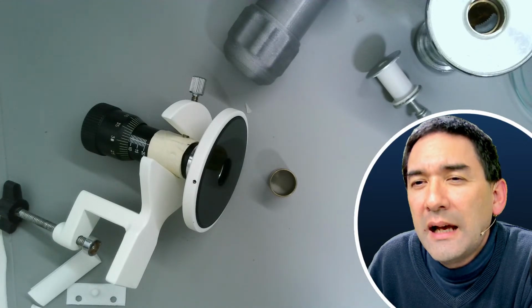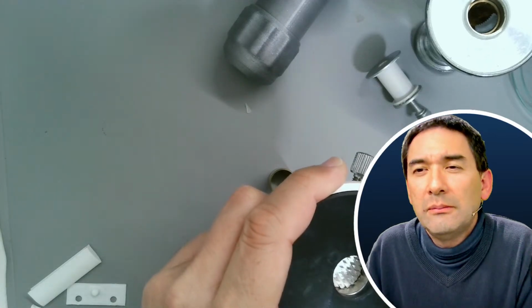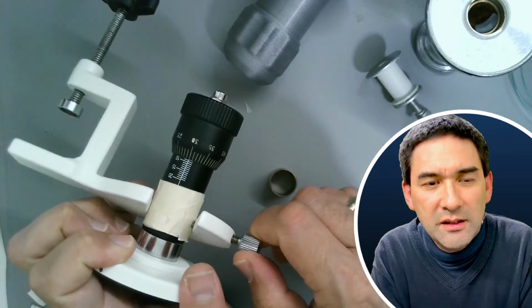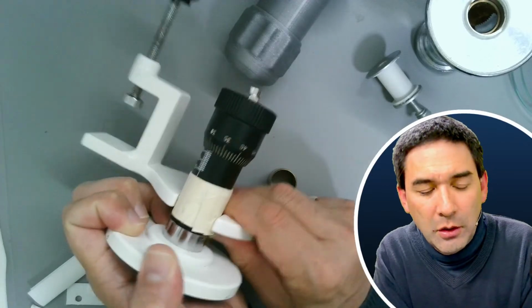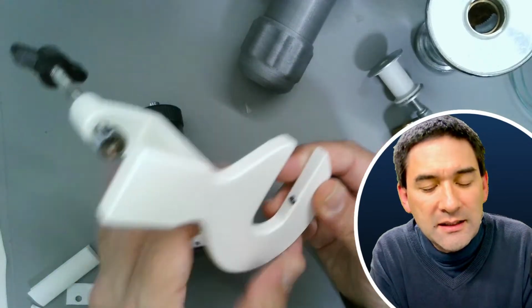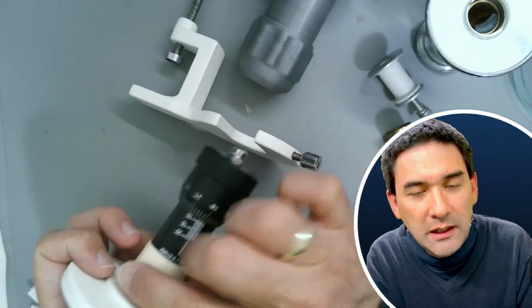Is it the hole on the side of the big white microtome? I don't understand now. The thing is, it's kind of held like this here, and this is the screw that holds the clamp of this one here. It's a little bit hard to move out because I added this paper tape around it to protect the actual microtome from scratches, because if you use something like this, it's going to scratch the microtome, and I don't like that. That's why I always add some kind of protective thing around that.